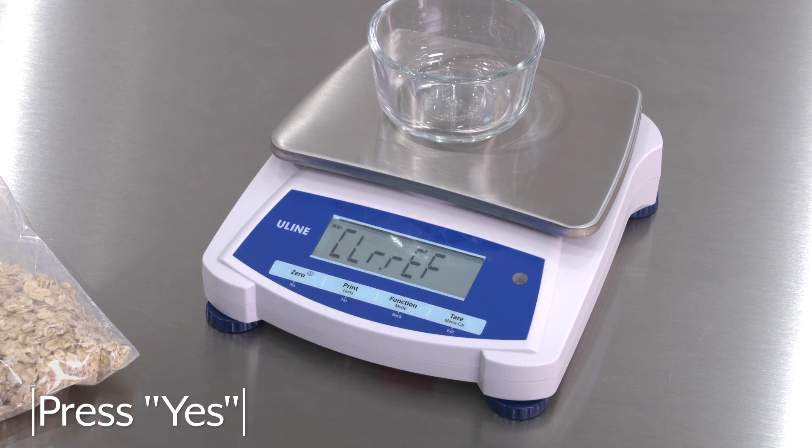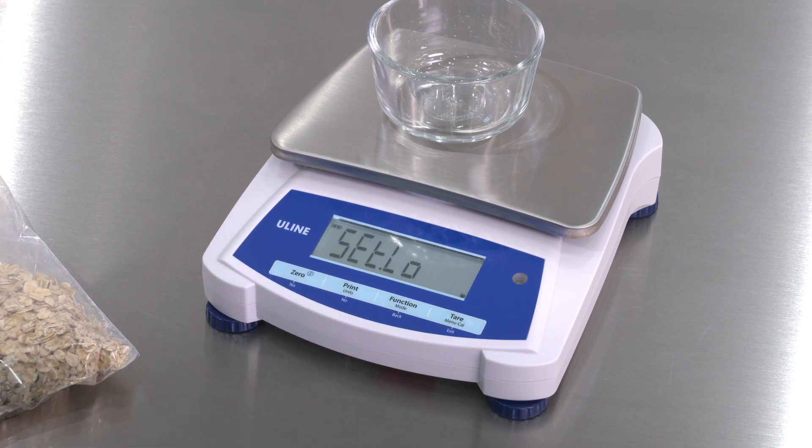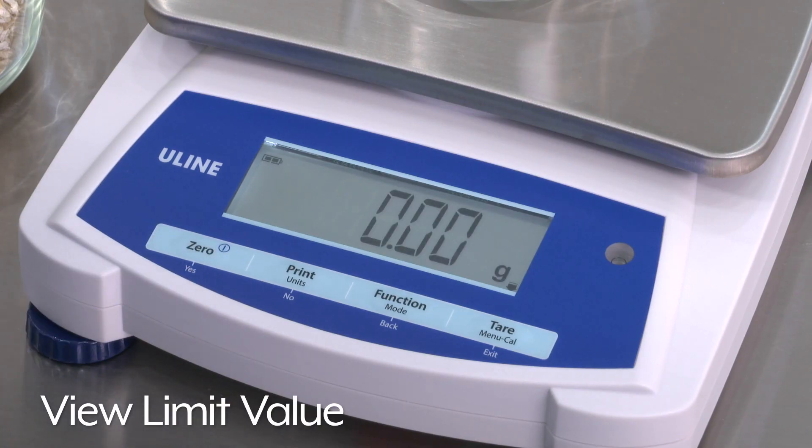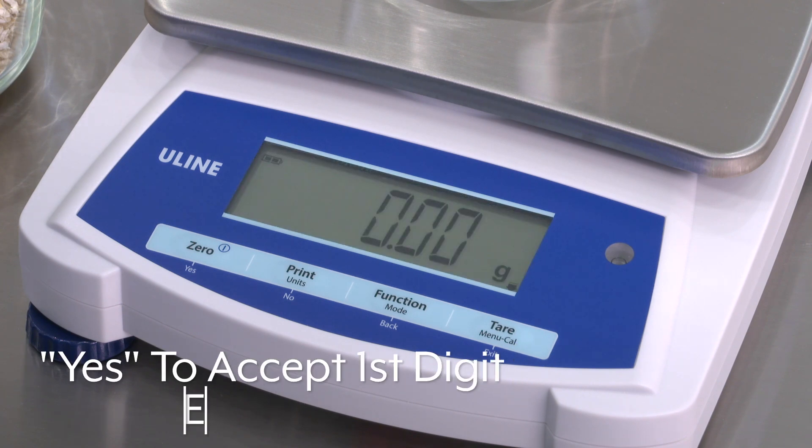Press Yes to set your low and high limit values. The balance will then display Set.Low. Press Yes to view the low limit value. Press Yes to accept the first digit or No to edit.